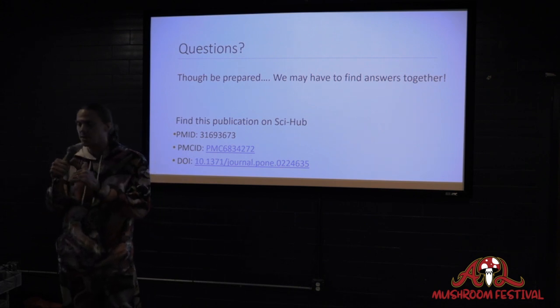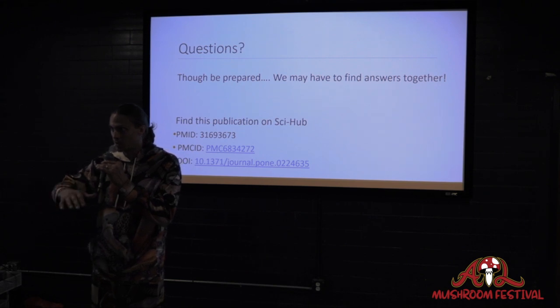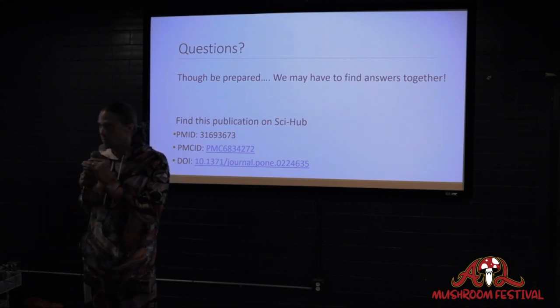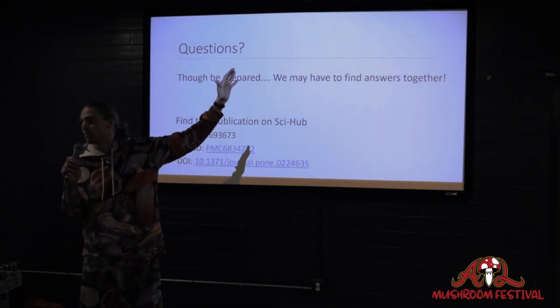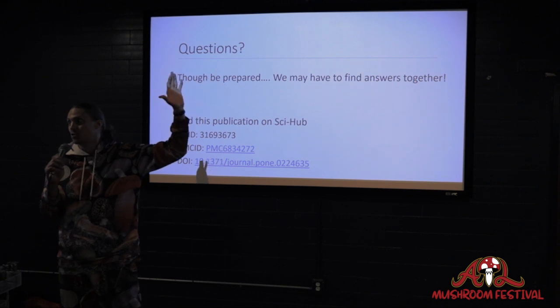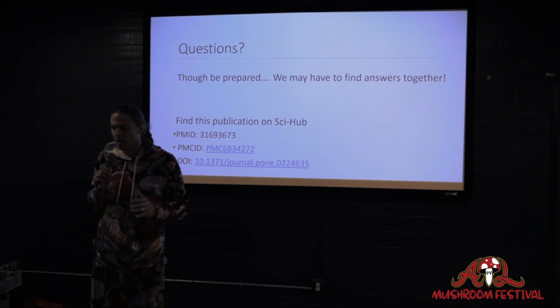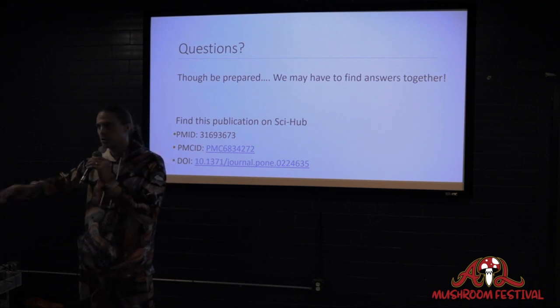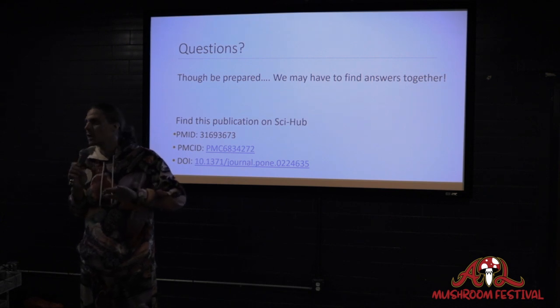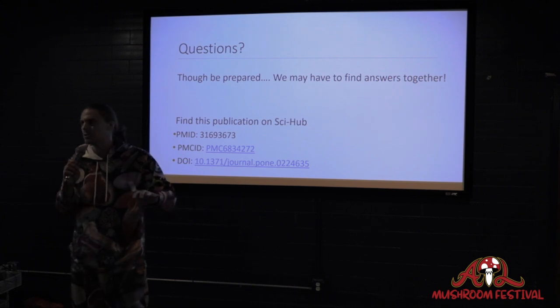But what ends up happening is you will see zone lines, distinct separation of the two types of mycelia because they are not compatible with each other. And if you know, going back to the very beginning of the talk, at least what you're looking for, then you know what you don't want. And from there, it makes it a little bit easier to be like, okay, I've got two different types of mycelia. This one's pearly white, like my original culture. This one is an off-white, almost a gray. And this one has nice fluffy mycelia. This one has super dense mycelia.